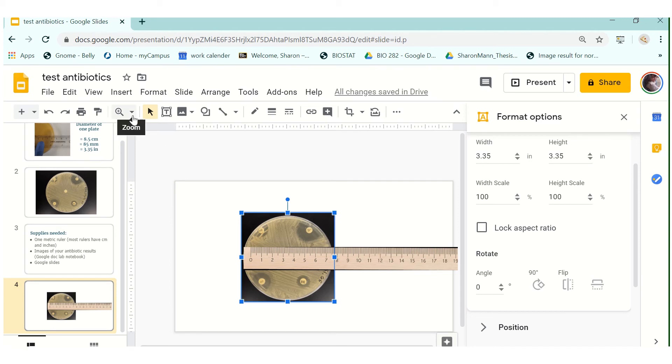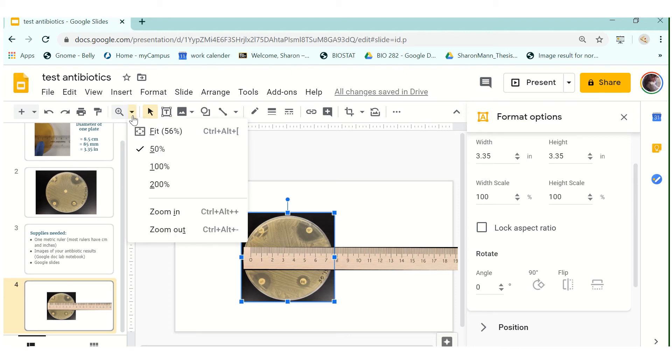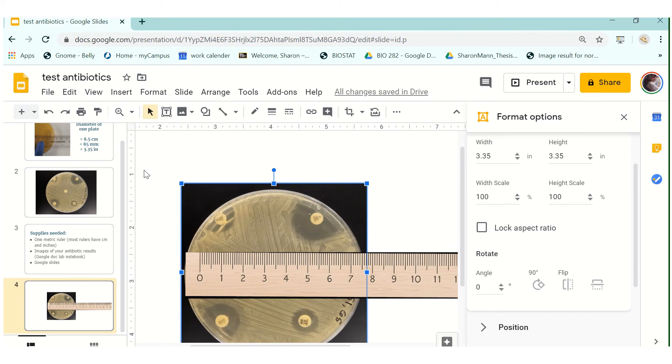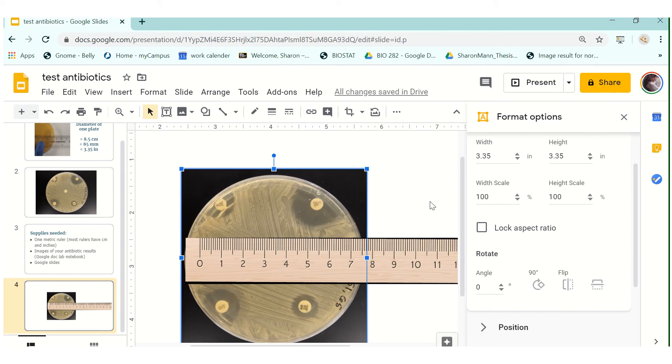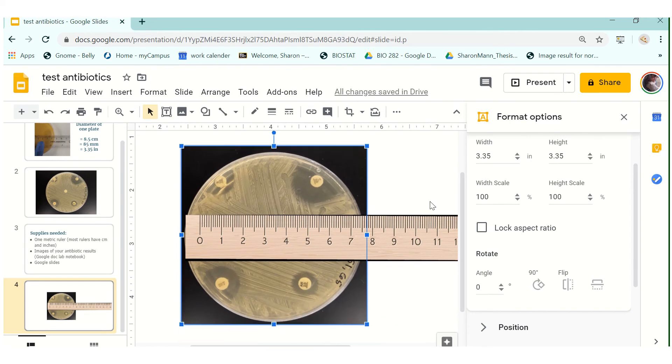Okay so the next important step here that you need to not forget otherwise this won't work is to blow up your screen to 100 percent. So the reason why we do this is because if you blow it up to 100 percent this should be the true size of the image when you have the dimension set.